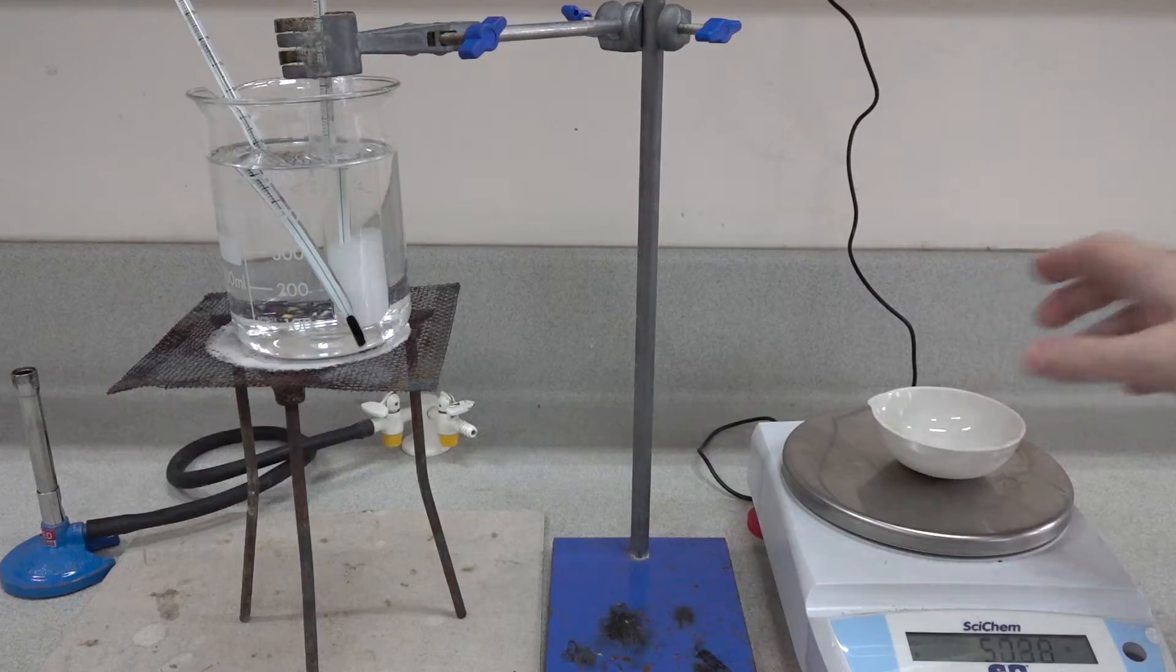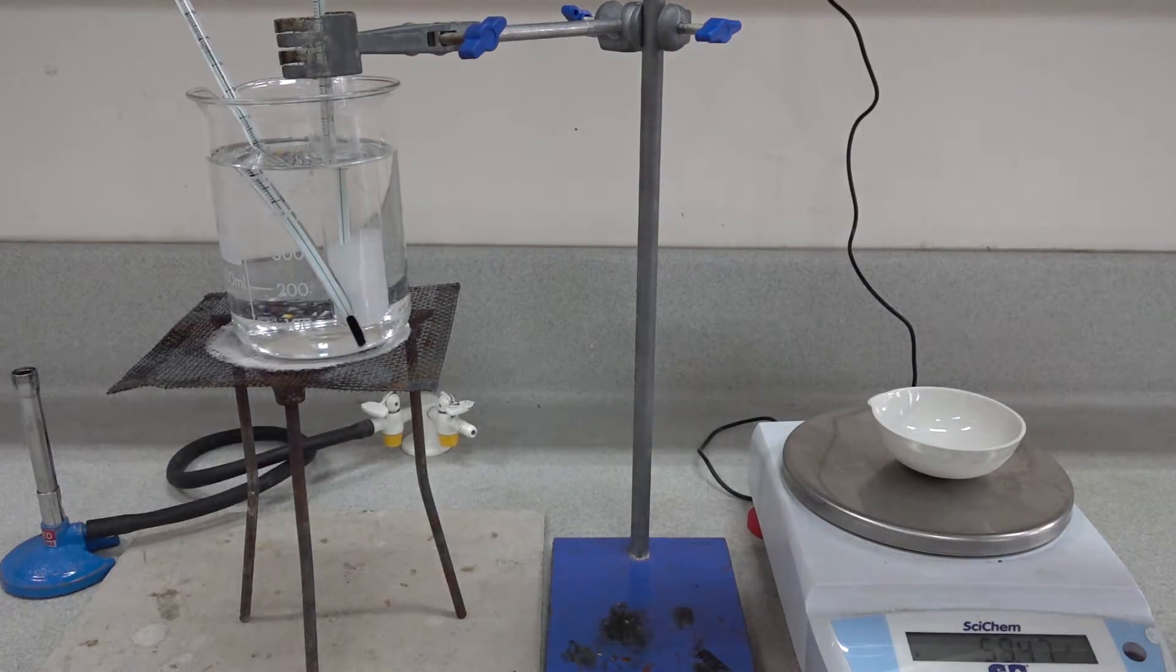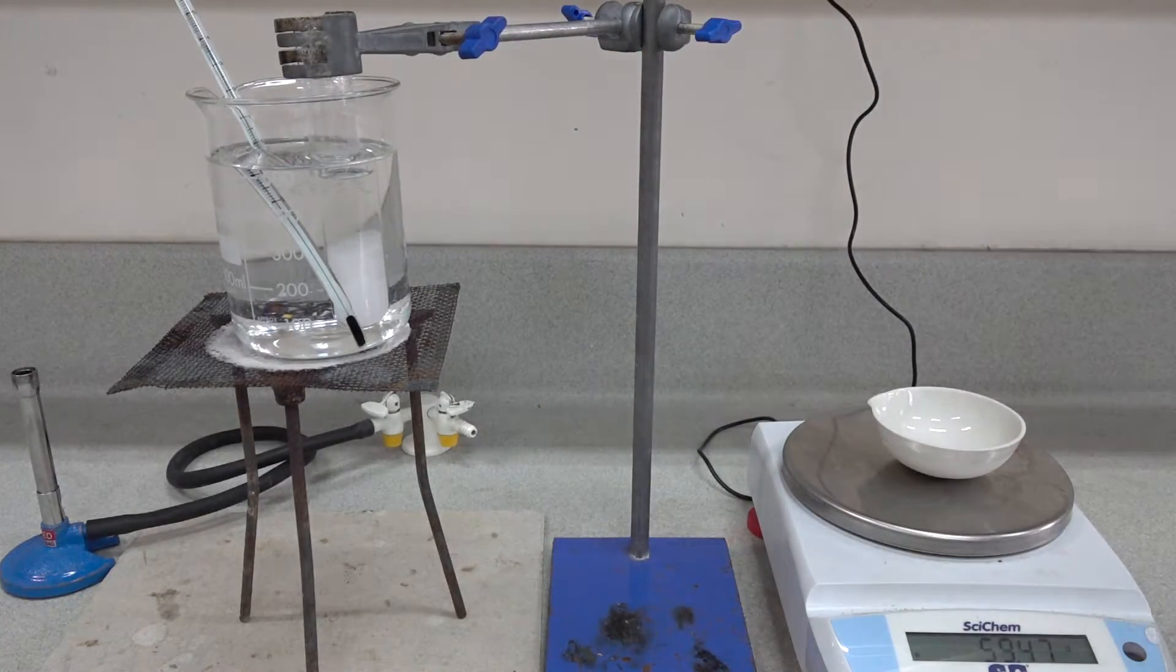So with this procedure we weigh an empty evaporating basin, that's 59.47 grams, and into that we need to place some of the potassium nitrate solution that's at 40 degrees C.